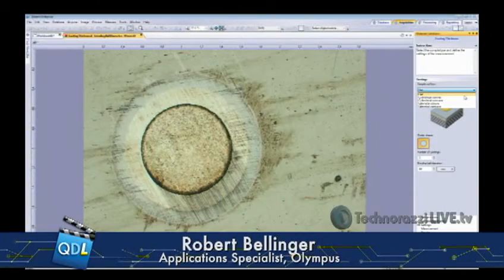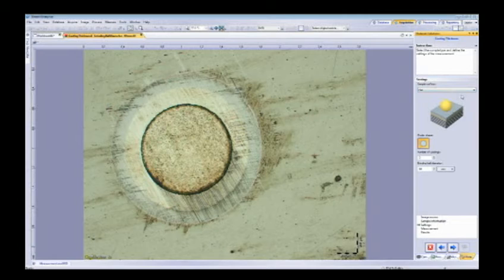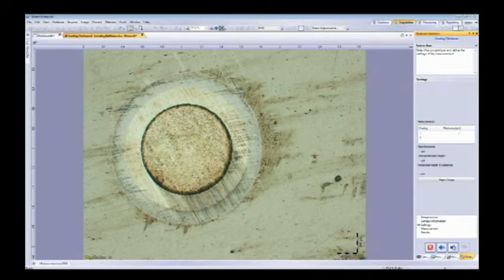And we hit next here. The settings for this, we can work on a flat image. We can also work on cylindrical or concaved. We just need to select what kind of material we did this work with. This one was a flat one. We type in the number of coatings. We type in the diameter of the grinding ball. And we just hit next.